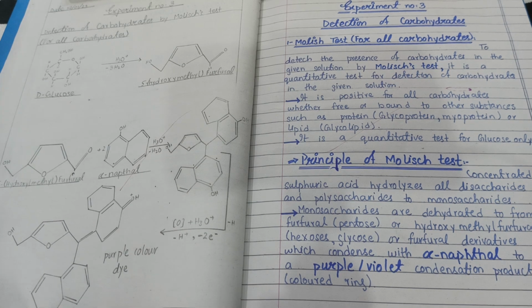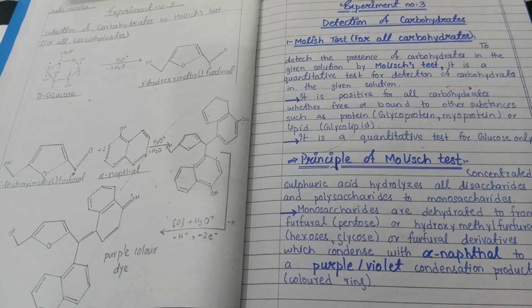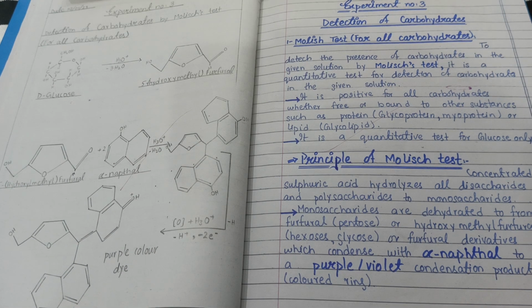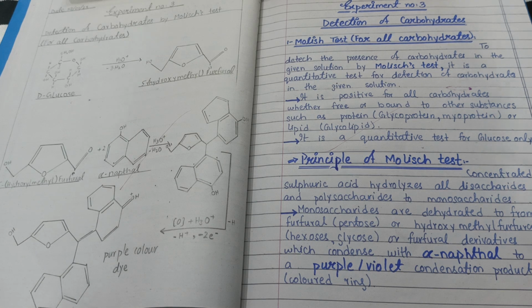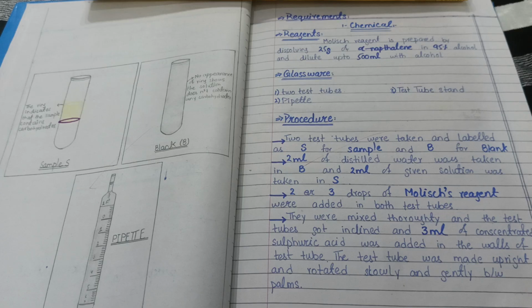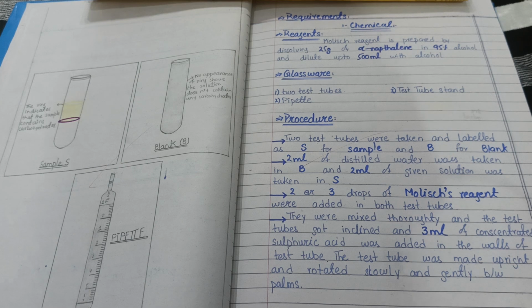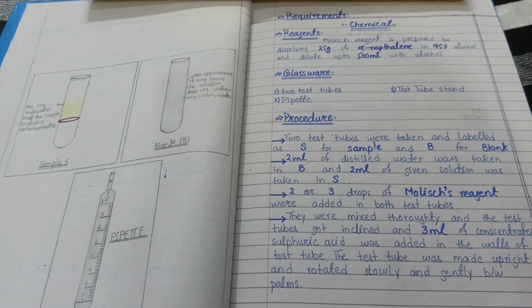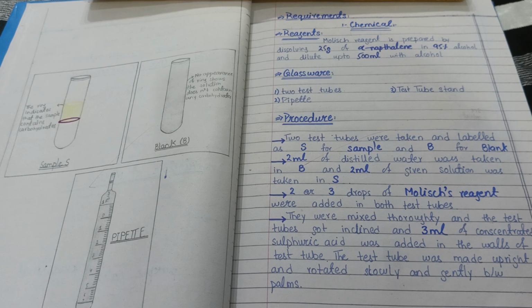Now we see how we are going to prepare this Molisch reagent and what apparatus we need, and we see the whole detail, how the solution is going to change its color and how much amount of Molisch reagent should be added. So these are some related questions. Now let's discuss it. We are going to see what the requirements are for this practical and for this test. You need some chemical apparatus and some glassware and physical apparatus. For the chemical apparatus, definitely you have to prepare the Molisch reagent.